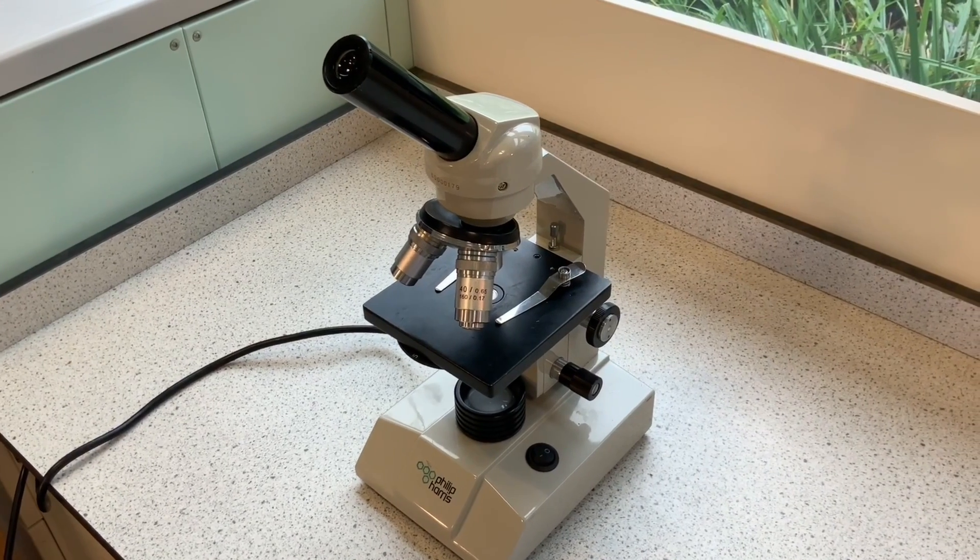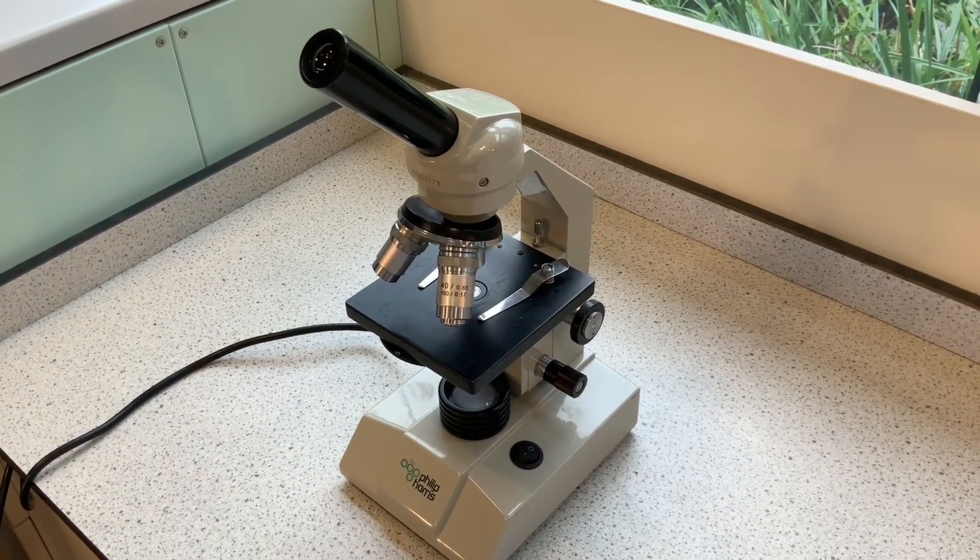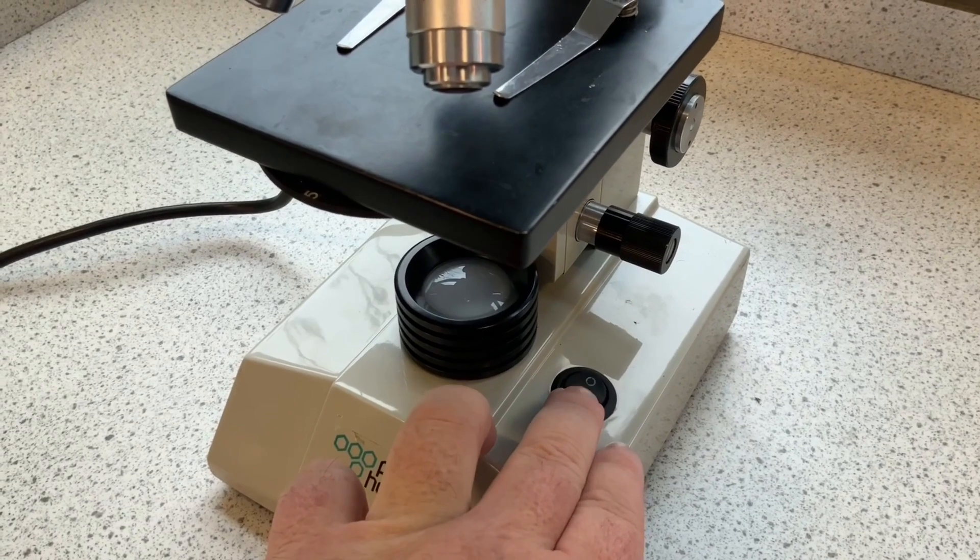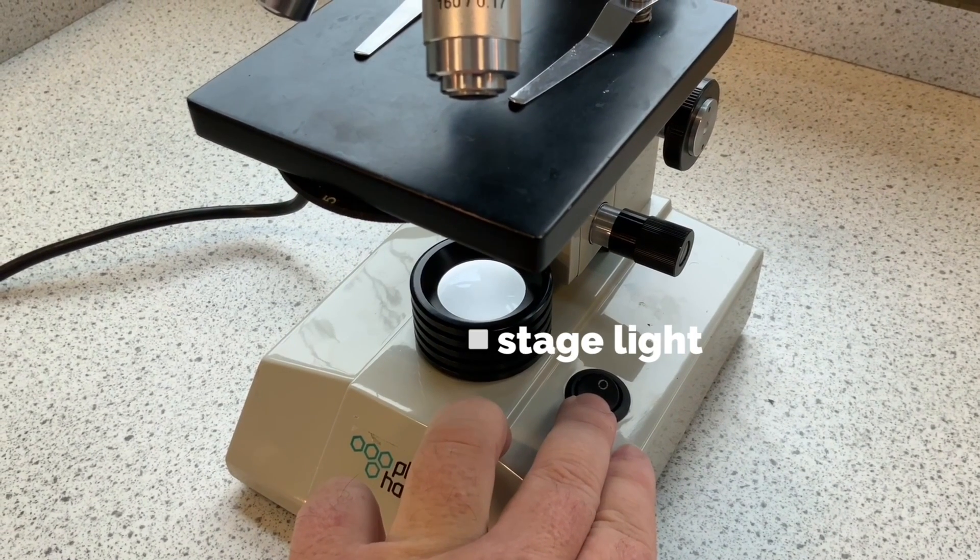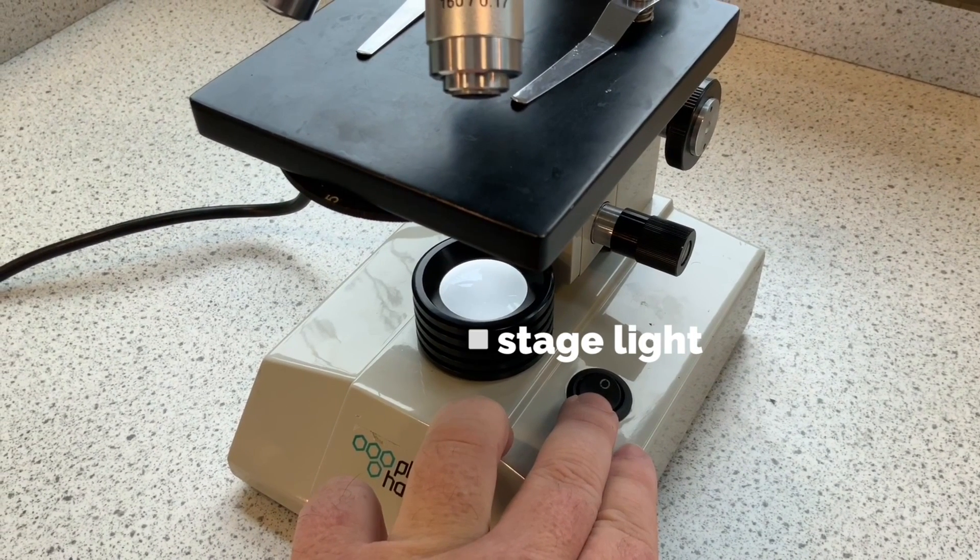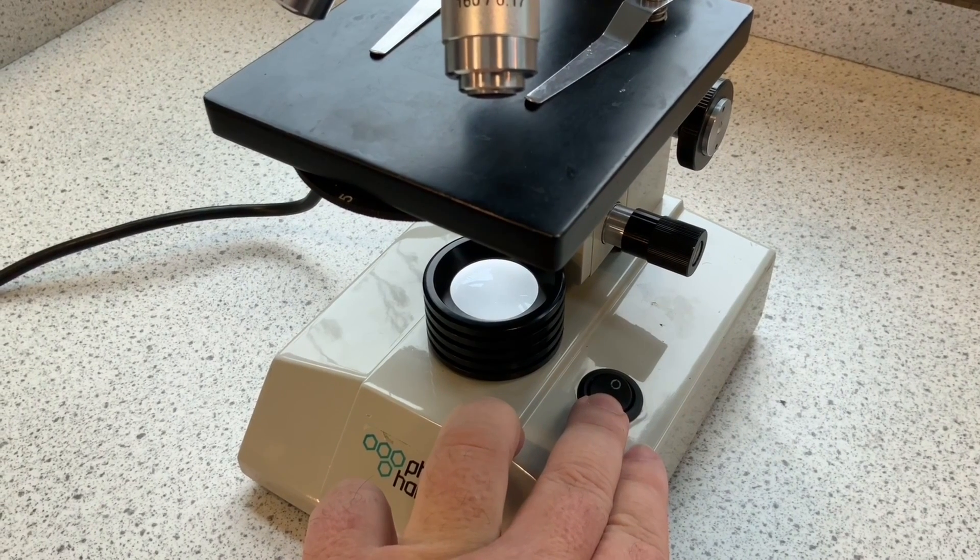The first thing we need to be able to do is to label and use the main parts of a microscope. We start off with the stage light. On some microscopes they have a mirror to focus the light up through the specimen. This one has a proper light.